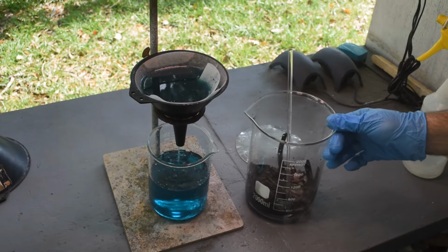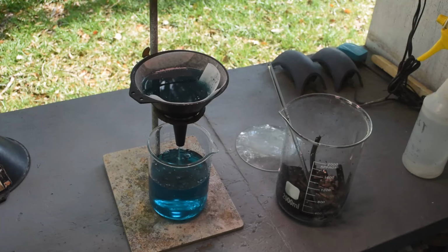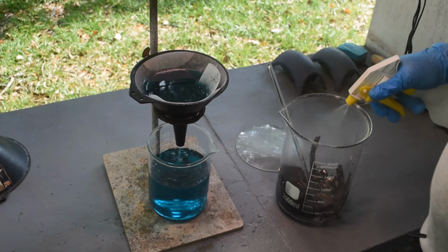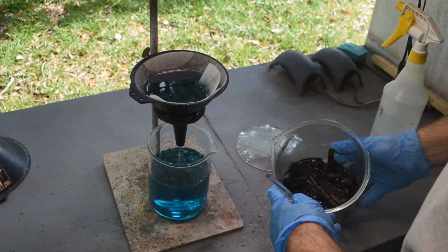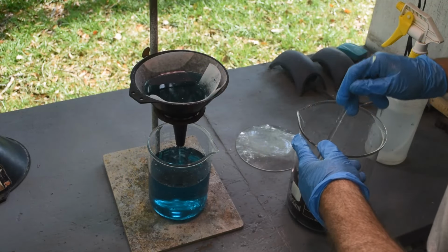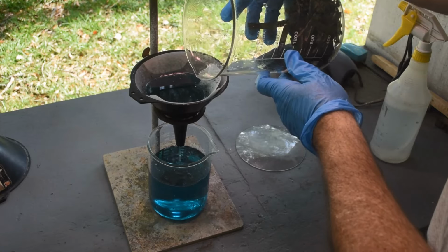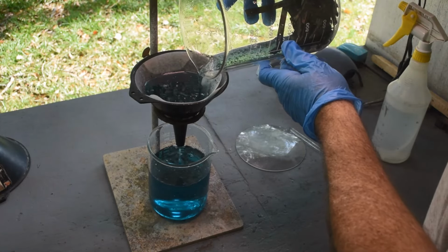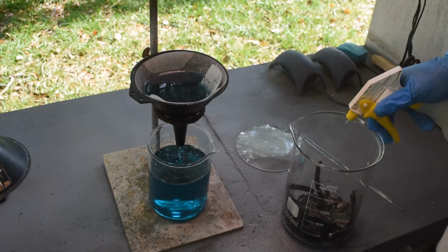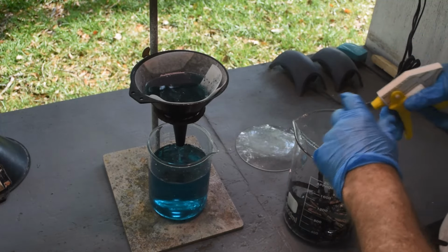Okay, so I've got the bulk of the blue liquid off of here, and I'll tell you what, in spite of my best efforts, a lot of the palladium flakes have wound up in the filter. So I'm going to rinse this stuff with a minimal amount of water here. You can really see the copper in there now. I hope that's showing up. And then we will move on. Yeah, there's more of the palladium coming over. I think I'm getting the bulk of it in this filter. My idea was to use another process to separate it, but it wants to float. I'm not sure why. Rather than sink to the bottom, I have much better luck with gold fingers. They sink to the bottom.